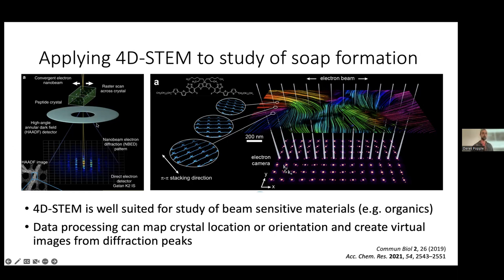That's this ring that's shown right here. And that would collect an intensity just based on the number of electrons hitting the detector. And you can get an intensity value for every single pixel, which allows you to create an image such as what's shown down here in the bottom left. And so this technique is well established.